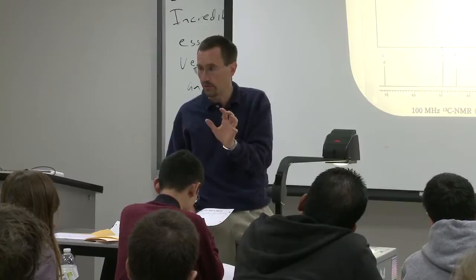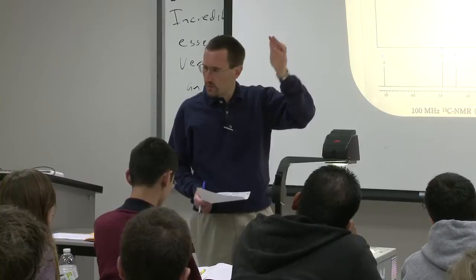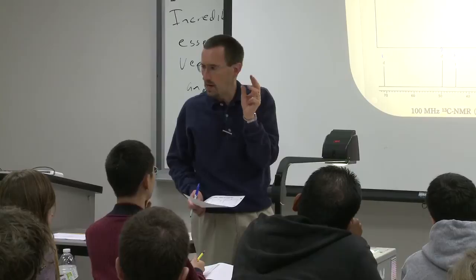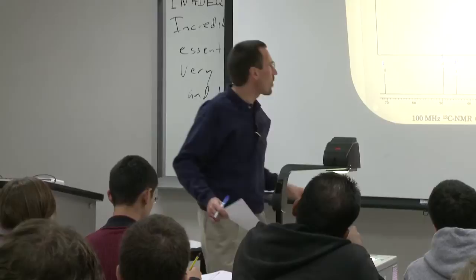In the off-resonance decoupling technique, you're partially decoupling. You're applying proton energy to flip the spins of the protons, but you're not doing so right at the exact right frequency, so you're doing so slowly. So your multiplets collapse down and you don't see your two and three bond couplings, and you see just your one bond coupling. And instead of having a quartet spread out with the lines 125 hertz apart, they're just like 10 hertz apart. Anyway, that older notation, which isn't used anymore, has stuck around.